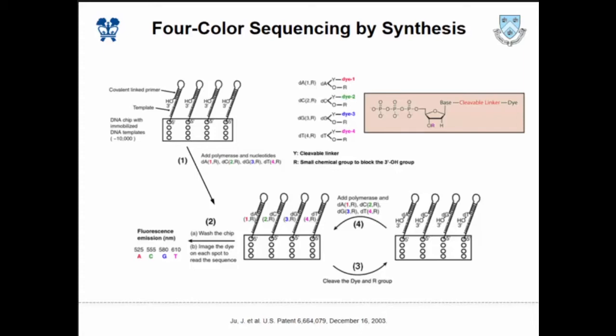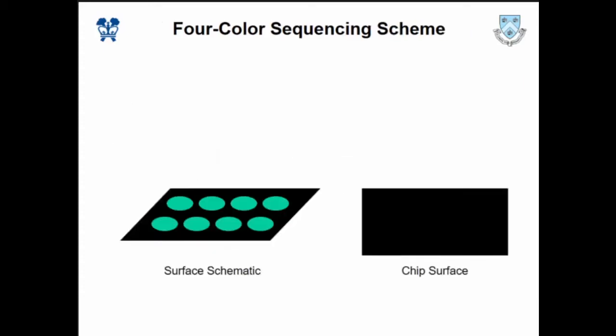Using fluorescent excitation, we will detect at what particular location or DNA strand the identity of the nucleotide is. Then we can remove the nucleotide blocking group and also the fluorophore to finish our first cycle, and we can repeat the second, the third, and the fourth base identification the same way. So this is how the current Illumina sequencers work. This dominates probably 80% of the market currently.